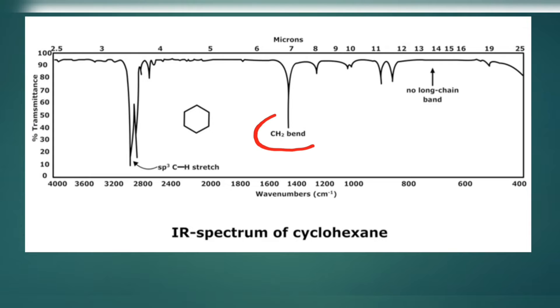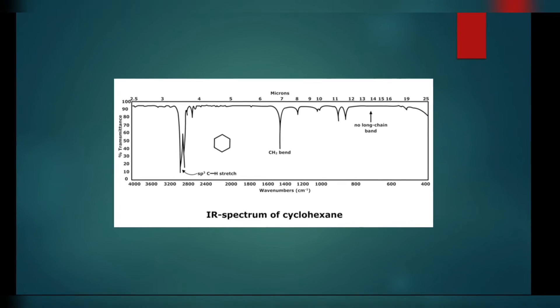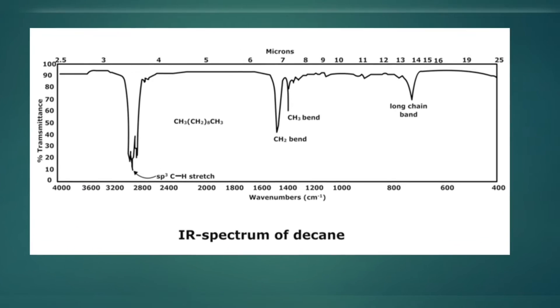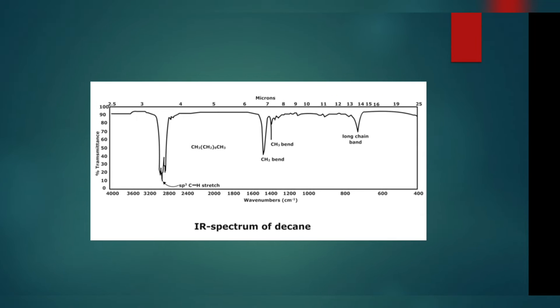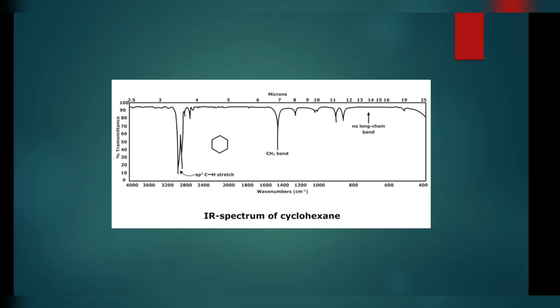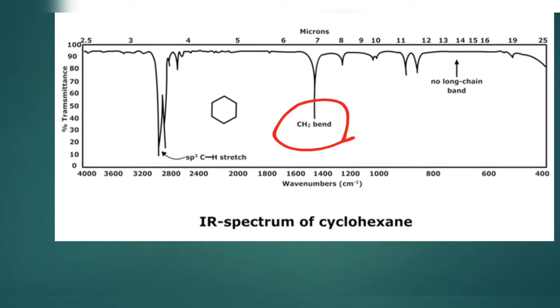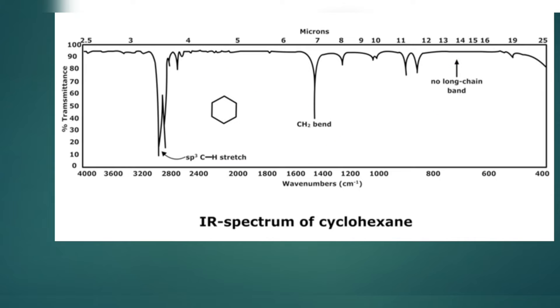This peak here indicates that there is a CH2 band and there is no CH3 band. Comparing with the last example, in decane we had two peaks — one for CH2 and one for CH3. But in this new example, we only have one peak for CH2, and there is no long chain representation. This means our molecule contains only CH2 and all C-H bonds are sp3 hybridized, indicating the compound is cyclohexane.